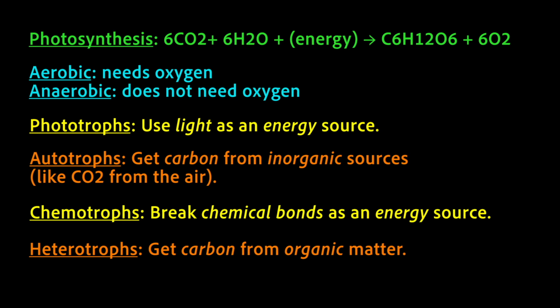Generally, we might find phototrophs and autotrophs nearer to the top, and chemotrophs and heterotrophs nearer to the bottom. If you take multiple samples from various locations, you'll also be able to observe the differences in microbial ecology corresponding to different areas.